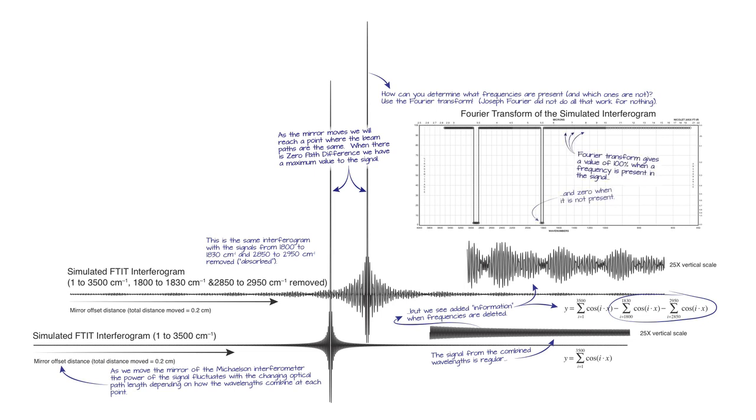So that's what the Fourier transform is going to do, and I hope that you will pay some attention to the Fourier transform presentation and get a sense of its power, and of course its limitations and some technical details about it that you have to think about when you're using your instrument. And of course it's going to become really important when we talk about NMR, because NMR signal processing uses a lot of details and things that you can change with the math of the Fourier transform. In IR, things are pretty cut and dried.